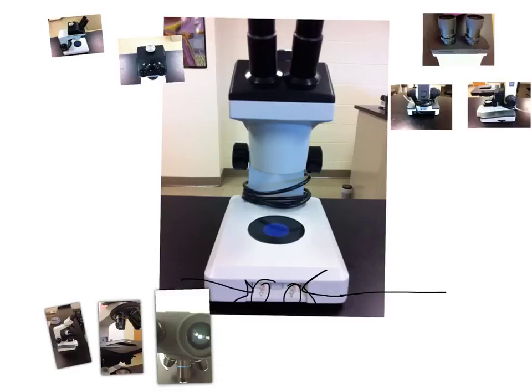Now we're going to talk about the compound microscope. So let me get rid of this here, shrink this guy down. You guys are going to be using the compound microscope to look at microscopic organisms. So here we have our compound microscope.